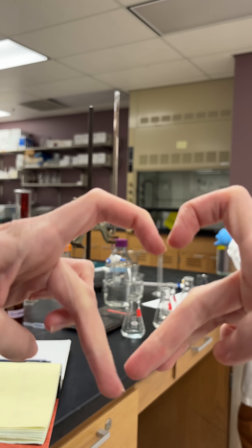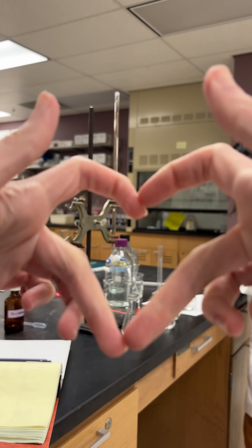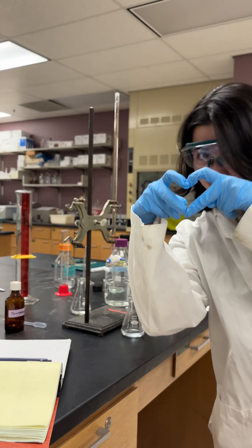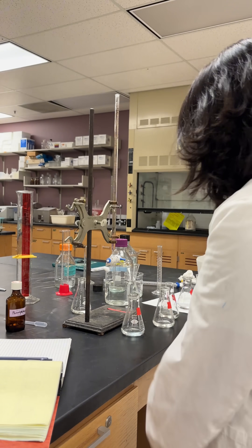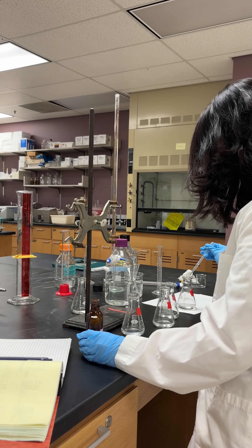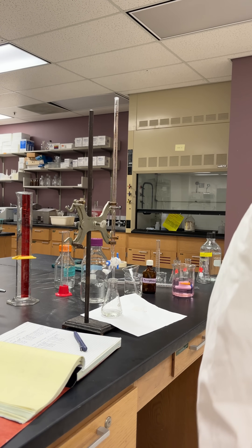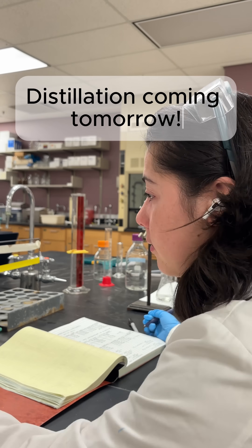Then my lab mate came in and started messing around with my camera and making different hearts with her hands, so it was a nice little happy moment in the day. Then I ran my titration using phenolphthalein on the HCl, and then I completely forgot to actually record myself doing those titrations. So instead you get to watch me do calculations, and then we're going to come back tomorrow for the distillation. Bye!